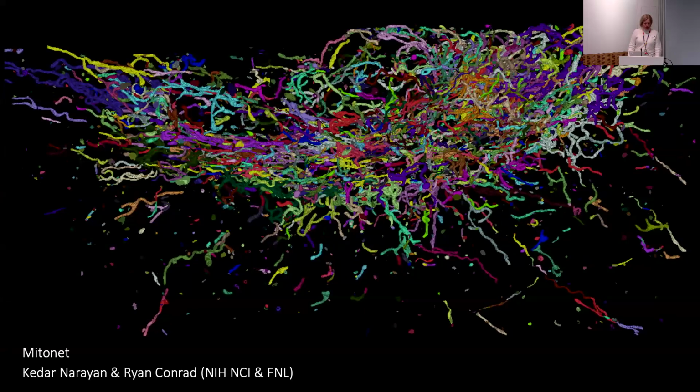So this is Kedar and Ryan's MitoNet, and that's applied to a FIB-SEM data set from a HeLa cell. So it's working way better than a person could on this data set in terms of time. But there are still issues. For those of you eagle-eyed people who are used to doing segmentation, some of these mitochondria are split into two, and some of them are joined with things that they shouldn't be. So again, the proofreading and correction, even on the organelle scale, would be enormous.